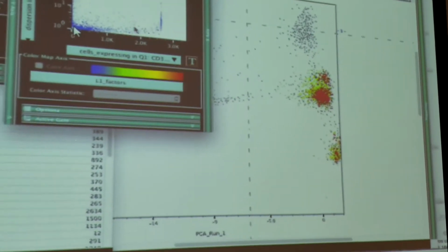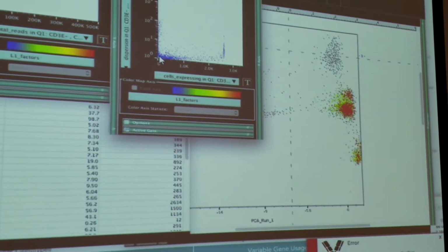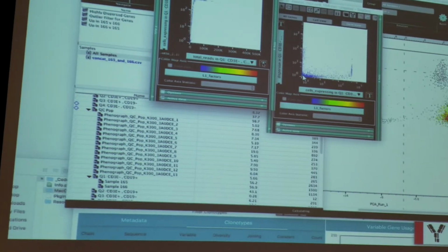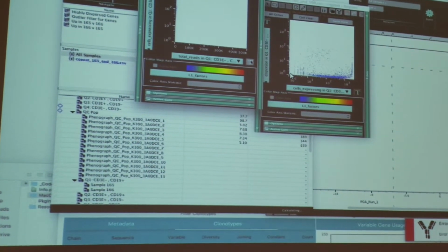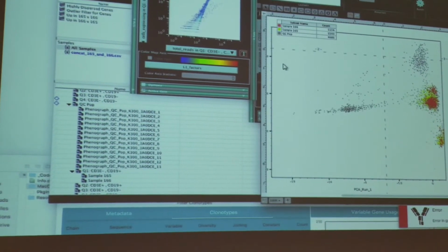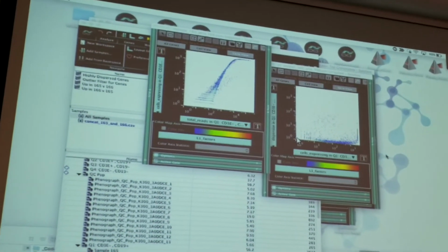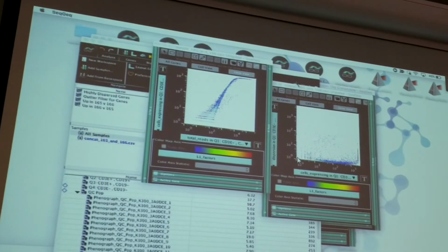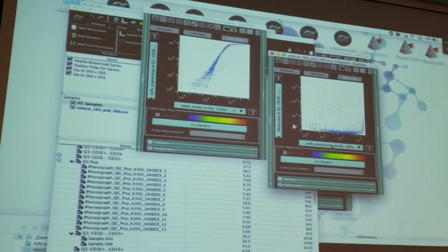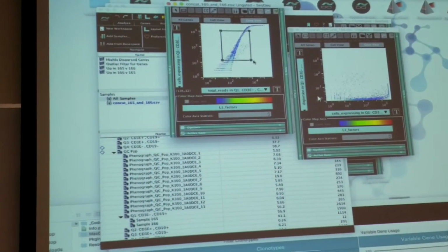The other thing I would want to do here is, now that we have B cells isolated, if we're happy that these are our B cell populations we want to look at, then we can repeat some of the previous steps, just in terms of quality control, and then look at a t-SNE plot of just B cells, to see if there are clusters that distinguish between 165 and 166, or might be of interest in that regard. And then we can ask for differentially expressed genes there. Hopefully we'd be able to do the VDJ exploration of that. Right. That'd be perfect. Okay, yeah.